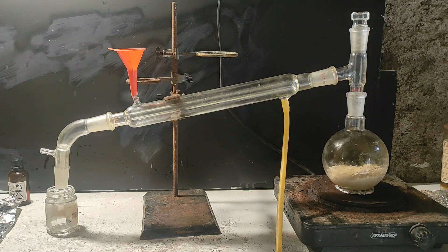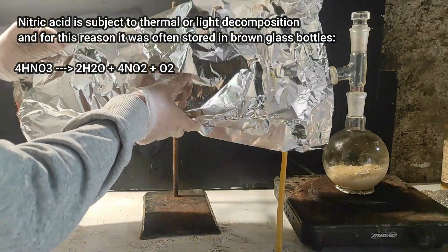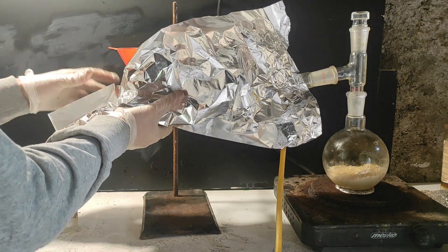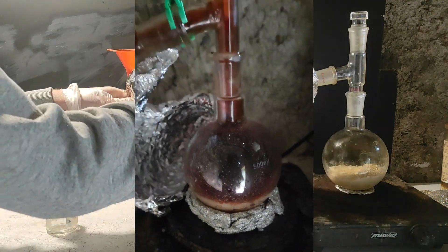I'm going to use some aluminum foil to wrap the glassware, because nitric acid has a tendency to decompose at high temperatures with light. This will maximize the yield and reduce the production of nitrogen oxides, which are toxic. In the past, I had done this reaction without aluminum foil and got so much orange gas that it started to become dangerous.